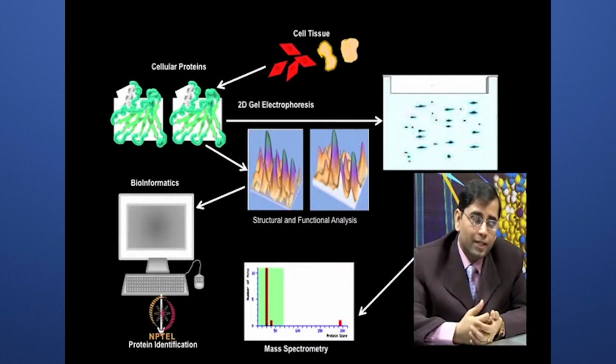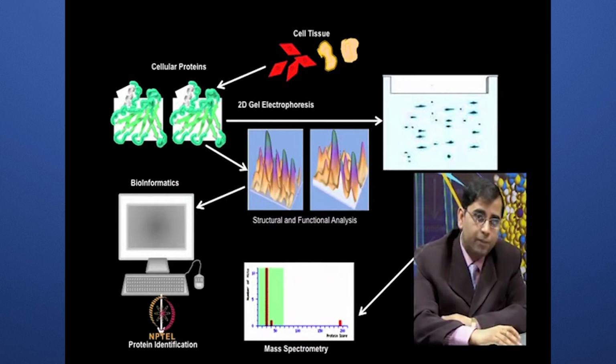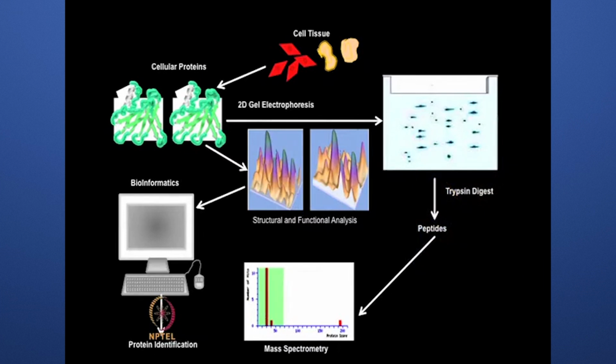where you can separate the proteins and compare the abundance of each spot as shown in the 3D views, and then the spot of interest could be trypsinized and identified. The peptide spectra can be generated from mass spec.